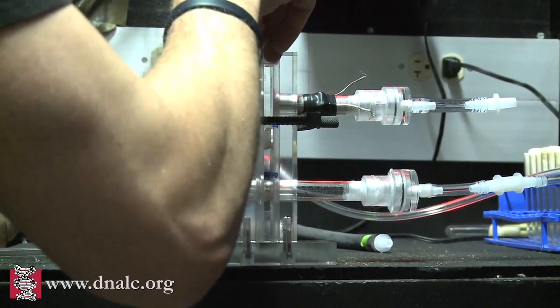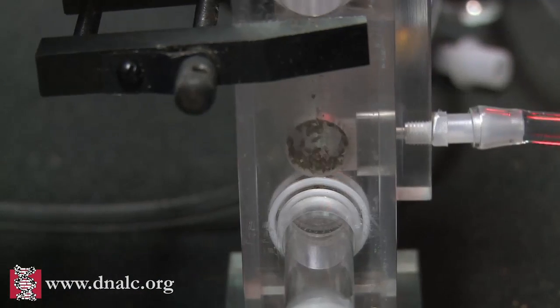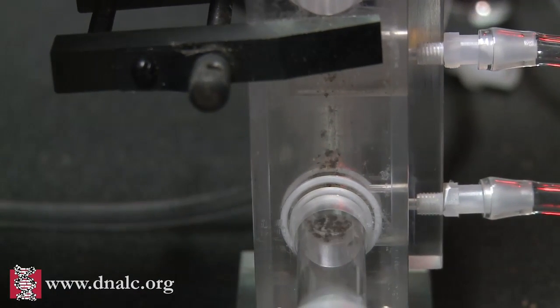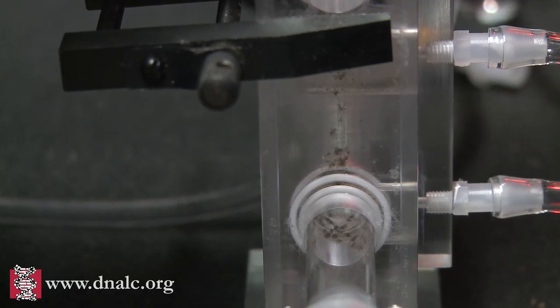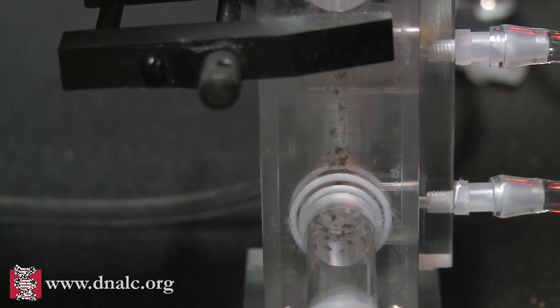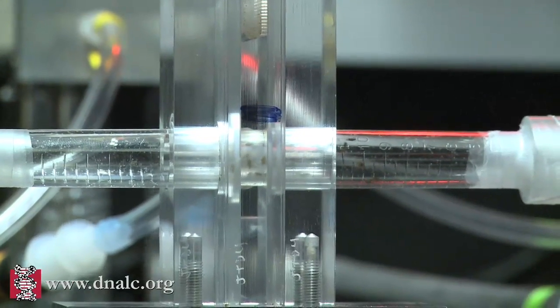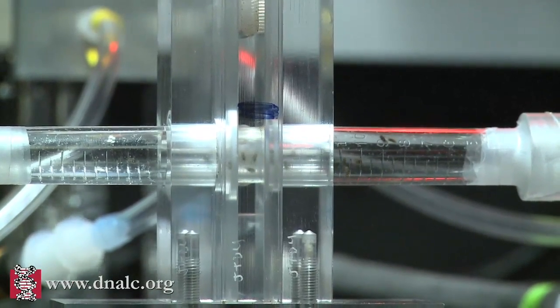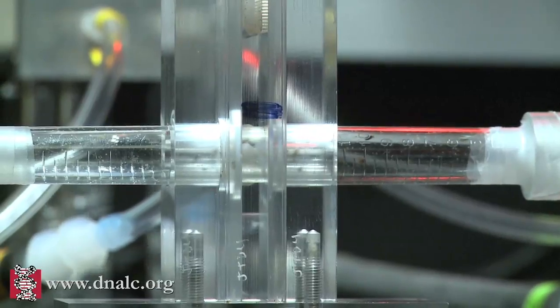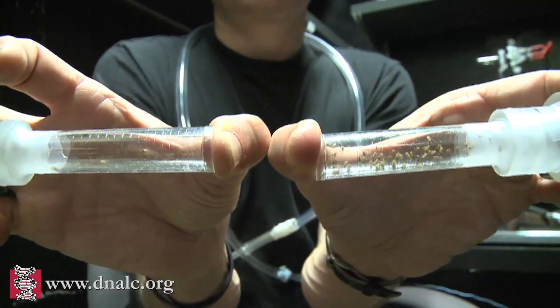We give the flies a choice by lowering them down in the elevator to the choice point where they simultaneously smell MCH on the right and OCT on the left. If they've learned their lesson that OCT predicts electric shock, they'll run to the right. And that's exactly what we see.